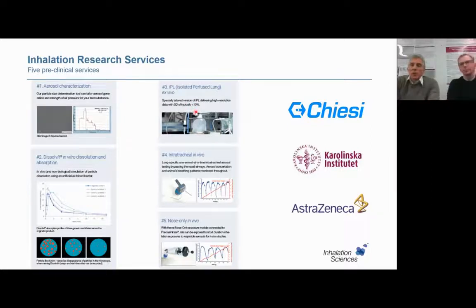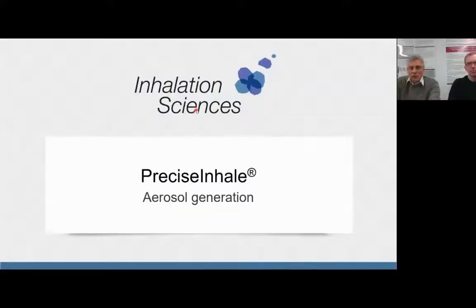So at this point, we move on and we will talk a little bit about the aerosol generator PreciseInhale, always from the point of view of generating and depositing the aerosol for the successive dissolution and absorption tests. So it's back to you, Mikael. Thank you.